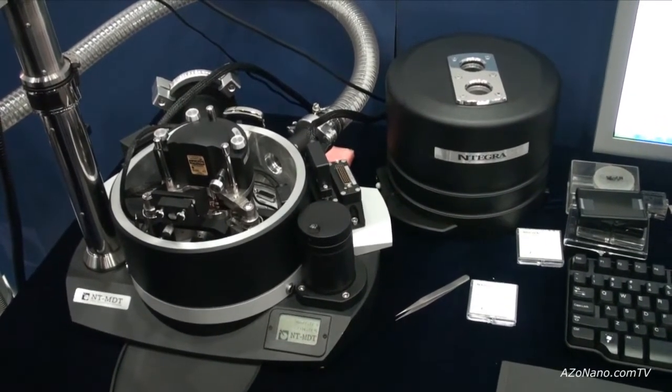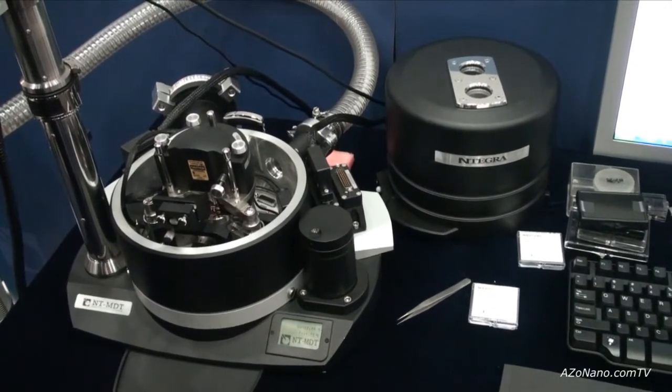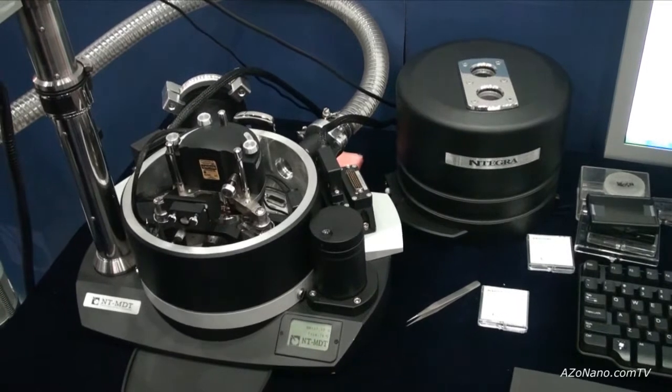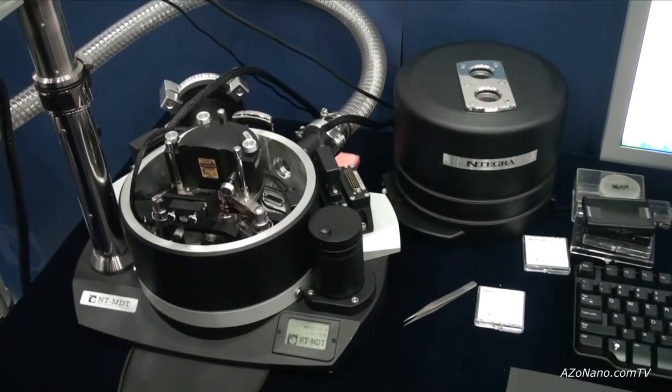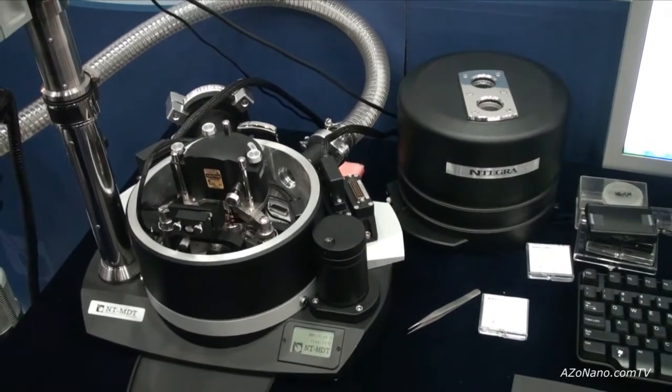In reality, when you do not change temperature in the chamber, you may stay in the same place with accuracy less than 3 nm per hour. This is the best drift you can ever get on the market.